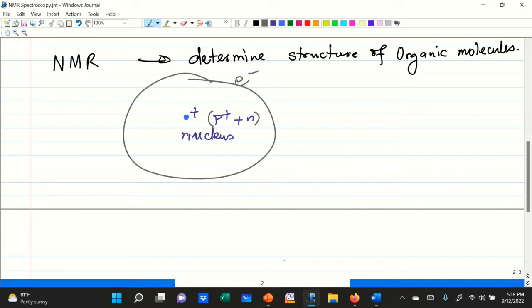The proton is spinning, the neutron is also spinning. This spinning motion in the nucleus is causing a magnetic field. However, it is only when the spin moment, not the time. Moment is a very physics term, many of you know. Moment basically means its magnetic strength and direction together. Sometimes it is given the symbol I. I will not burden you with various symbols. It has a certain magnetic moment.